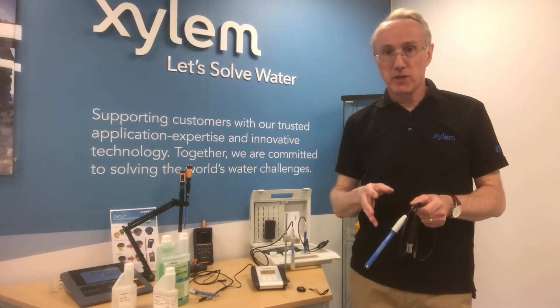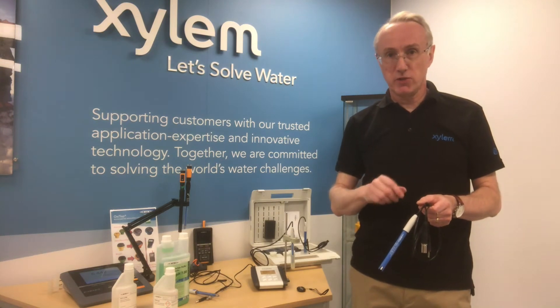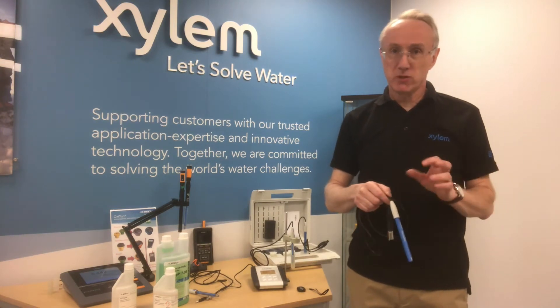Hello, my name is David Hall from Xylem. I just want to take a couple of minutes to talk about pH. pH is the second most common parameter measured in a laboratory after temperature, but probably the most misunderstood.